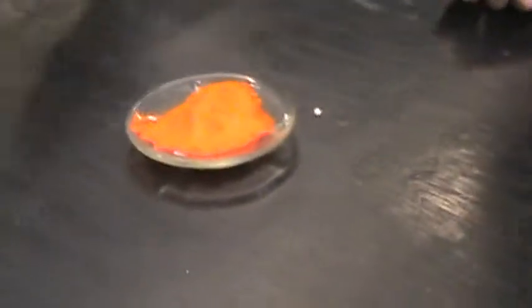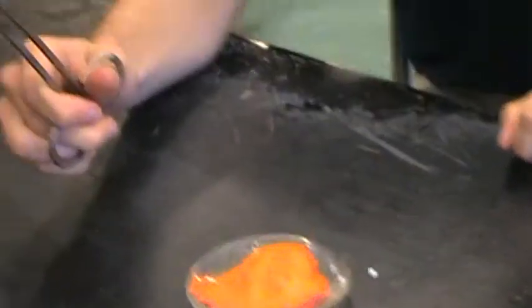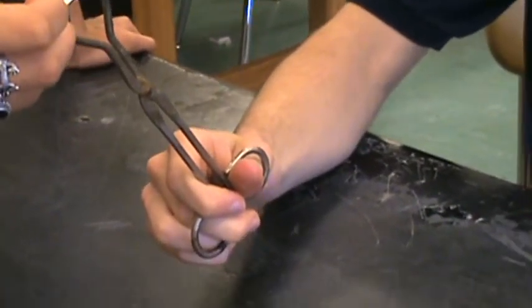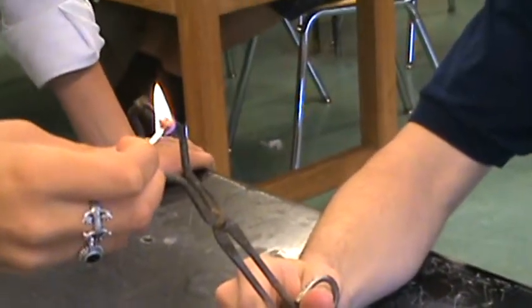Ready? Yep. We're on. Okay, so there we go. You want to make sure you keep your fingers away from it so that when it ignites it doesn't burn you.